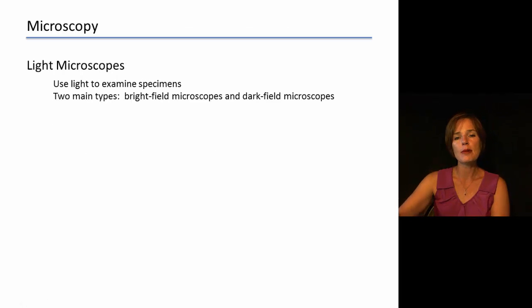Okay, so if we talk about different types of microscopes, there are many different categories of them. They do have different abilities to magnify, different abilities to resolve, and that's really based on the different characteristics of the electromagnetic radiation that they're using, whether it's light that's in phase, and so on. So we will go through these characteristics now as we talk about the types of microscopes.